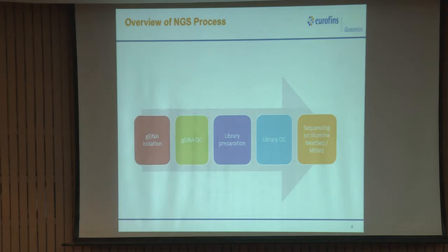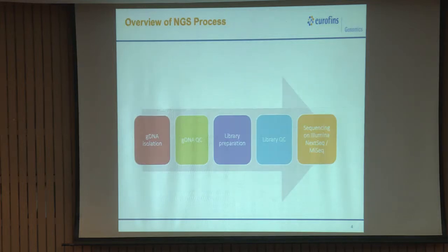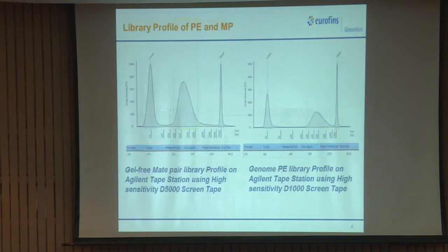This should be my library size, having an adapter of 120 bases. So, we minus it. So, we should have a DNA template somewhere around 250 to 350, wherein I have a very small insert size in it, right. Then we do a sequencing, and how the sequencing looks, we will see. We get two pairs of reads, that is R1 and R2, right, that is forward and reverse in case of paired end. So, we will see how the sequences also look.